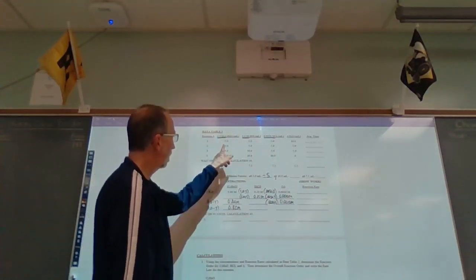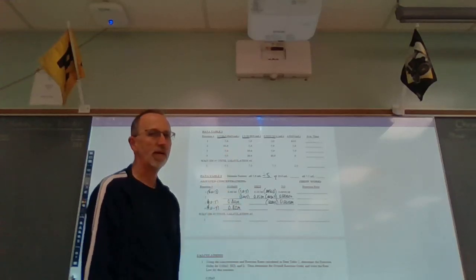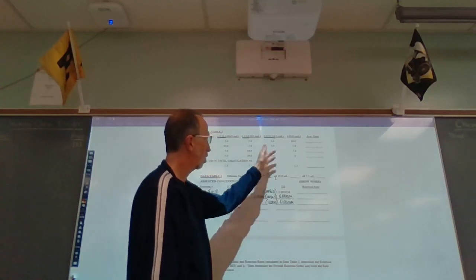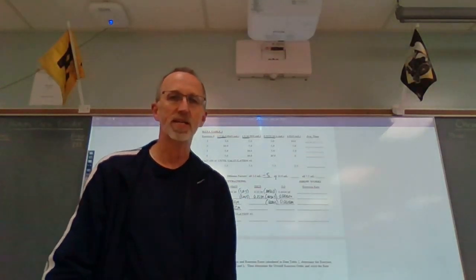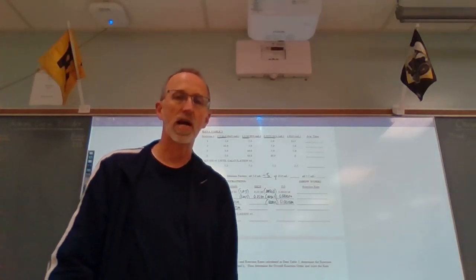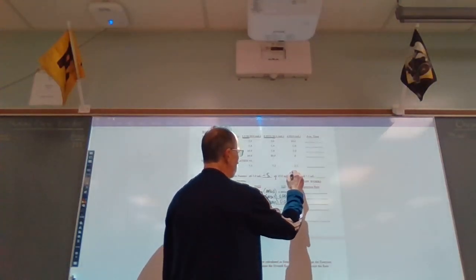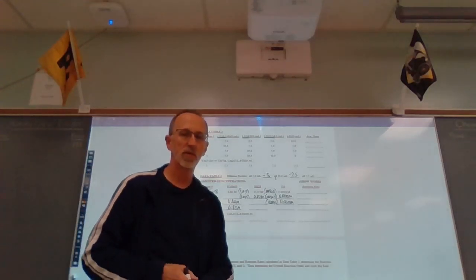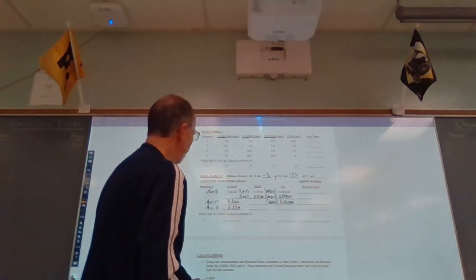Now, here we have some tens, all right? So if you start out with 10 mLs initially at 4 molar, but we end up with a total volume of 25, now 25 divided by 10 is 2.5. So we have diluted our original concentration by a factor of 2.5, and that will be true of all of the initial concentrations that we started with 10 mLs and then diluted to a total of 25.